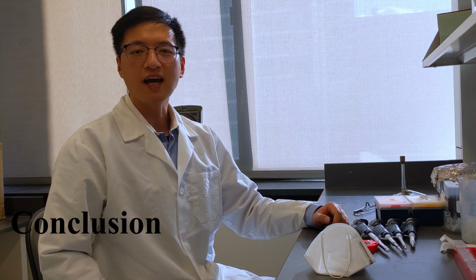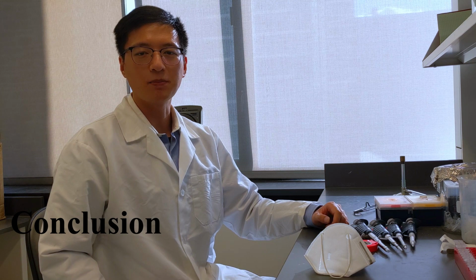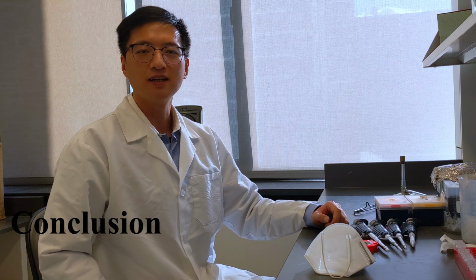Now we have shown that both P. rubens and the penicillin produced by P. rubens can effectively inhibit or even kill S. aureus. I hope this video can be helpful in understanding the discovery of penicillin.